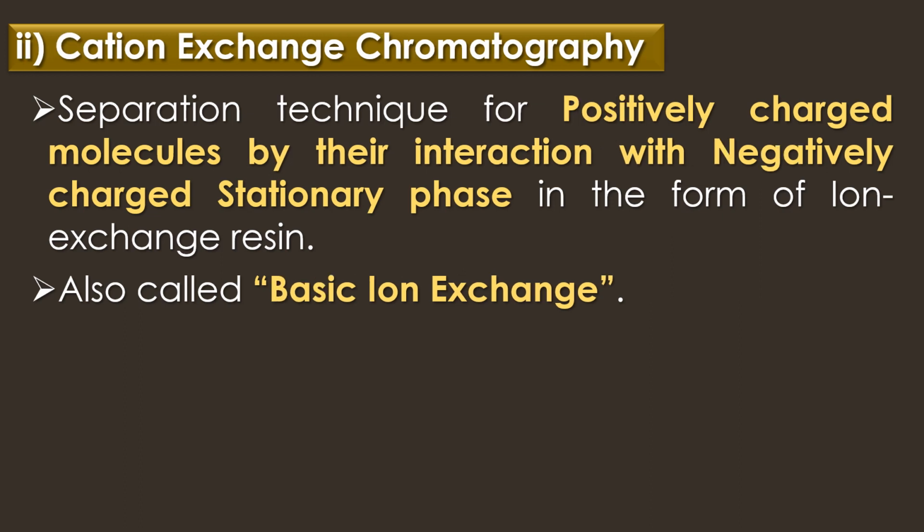The second type is cation exchange chromatography. Cation exchange chromatography is the separation technique for positively charged molecules by their interaction with negatively charged stationary phase in the form of ion exchange resins. It is also called basic ion exchange.